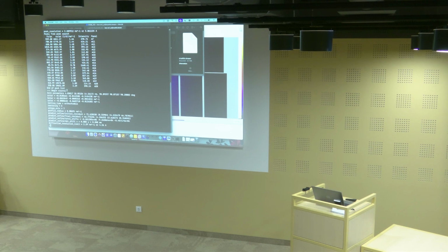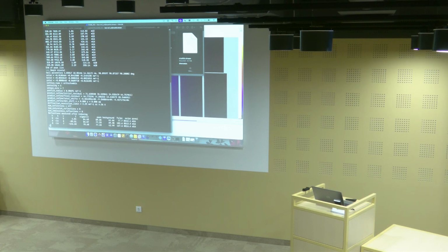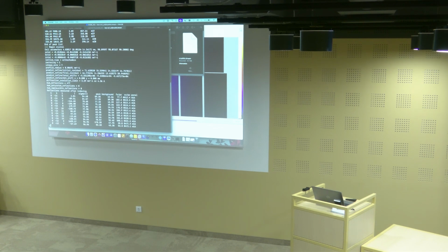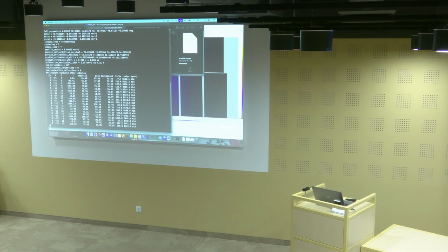So it means that if we could index an image, we found a crystal. So these are the cell parameters of that crystal. Take care, we like to think crystallographers like things overall in angstroms, but take care, sometimes it might be reported in nanometers. So this is the cell parameters in nanometer. Also, we have them in reciprocal space. There's some other information, which is not the most important one.